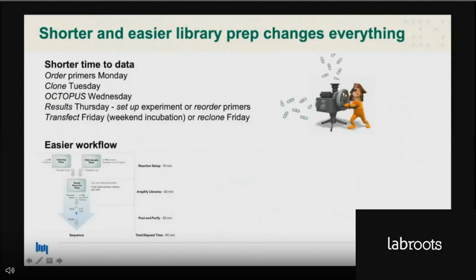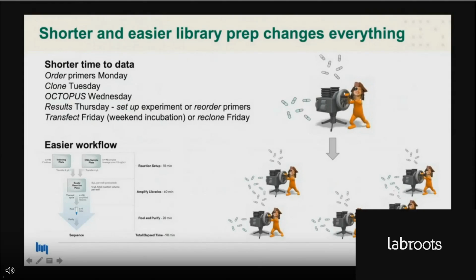The other side of this too is, a lot of people reach out to us about OCTOPUS, and I know of at least 10 companies that are probably using OCTOPUS right now. And I would imagine many more would use it if they knew it was this easy and was literally faster than Sanger. And so we also imagine more turns of the crank, democratized out to everyone within Octant, but also outside of Octant too, in which we're really excited to be able to share this protocol.